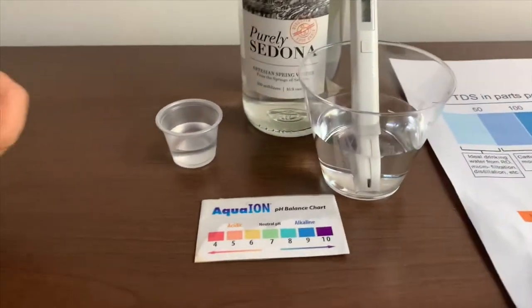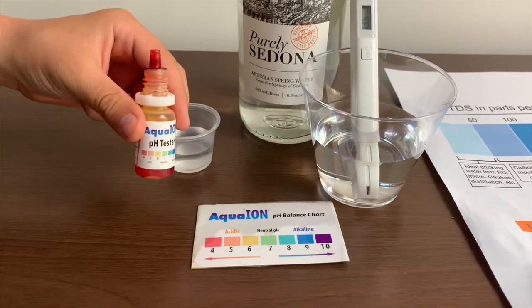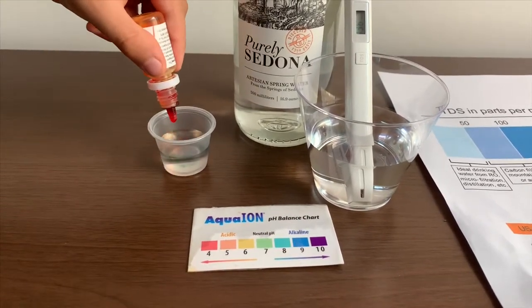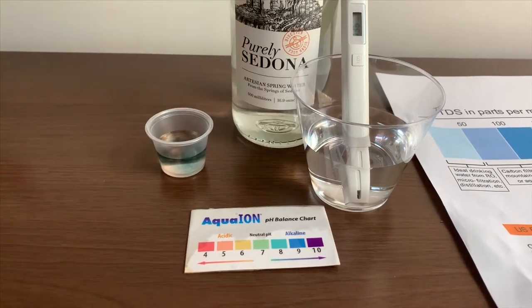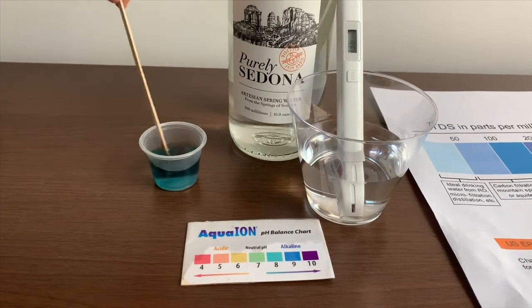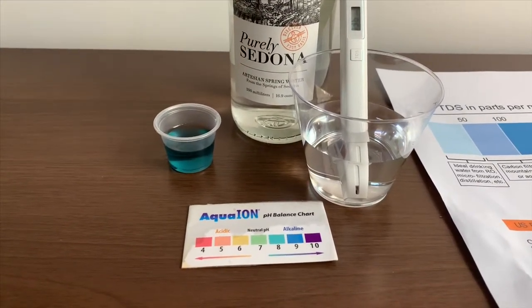Now let's test the pH level. If you want to buy this pH tester, check the link down below. Only do two drops. Let's stir it a little for a better result. I give this an 8 — this is alkaline water.